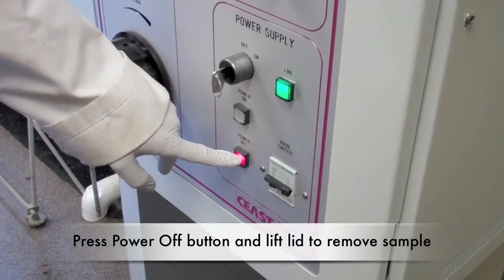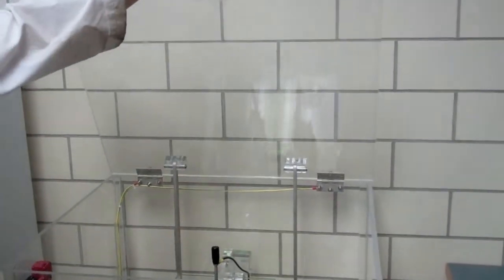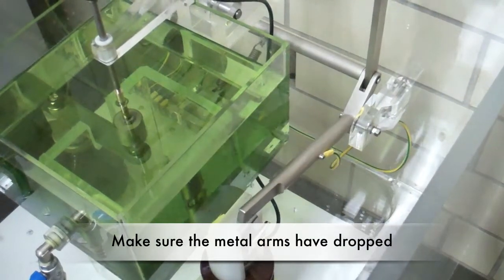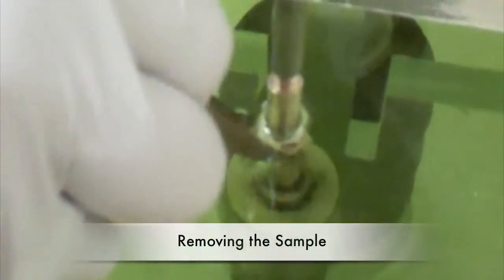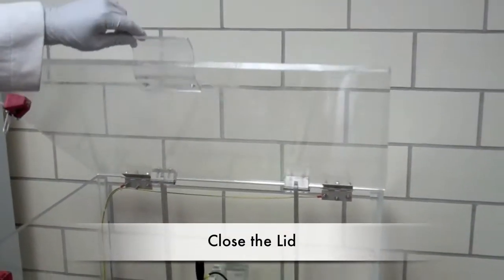To remove the sample, press the red power off button and lift the lid. Make sure the two metal bars are lowered before you reach in for your sample. Secure your sample with tweezers and lift the top probe to remove it. Shake off any excess oil and close the lid.